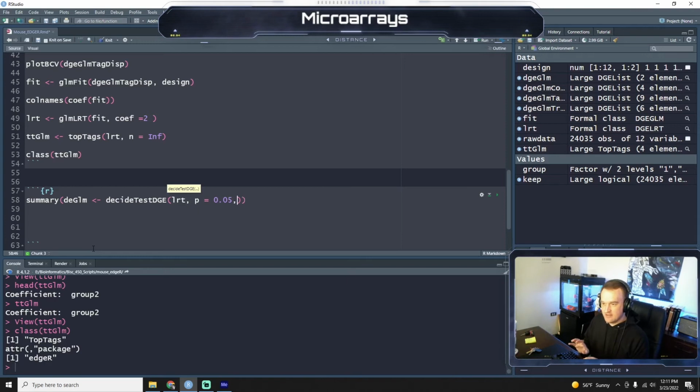And we can adjust the p-value here. So 0.05 is kind of the normal standard, I guess, in biology. But if you have a messier system or a messier data set, you might want to change it to 0.1, so you allow a lot more error. If you have a nice tight data set, maybe you want to be more stringent, you can do 0.01, etc. We're going to show that our adjustment is that false discovery rate.